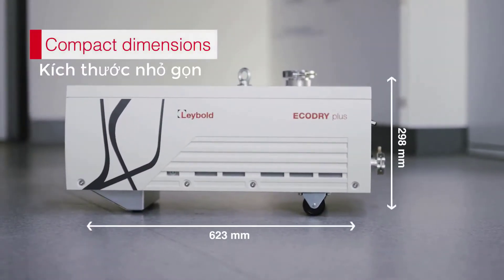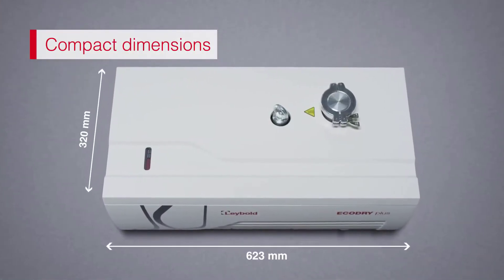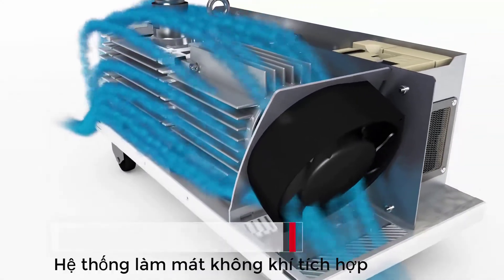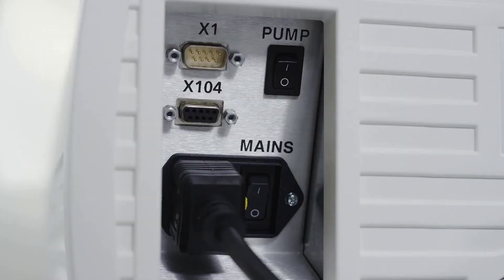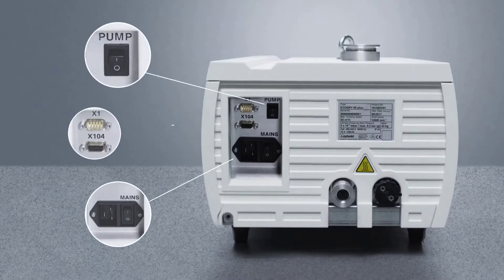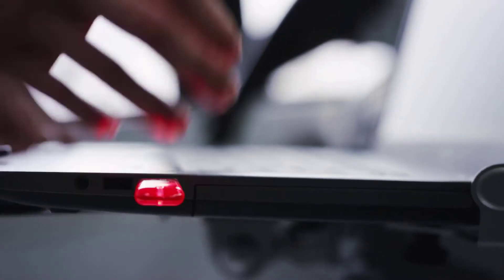Thanks to its compact dimensions, installation is just as easy. The Eco Dry Plus can be plugged into a regular wall socket. Thanks to the integrated air cooling, no coolant circuit is required. All of the operating elements are conveniently located on one side of the pump: a gas ballast switch for pumping condensing vapors, the power socket, the start-stop switch, as well as interfaces for remote operation via a control system or computer.